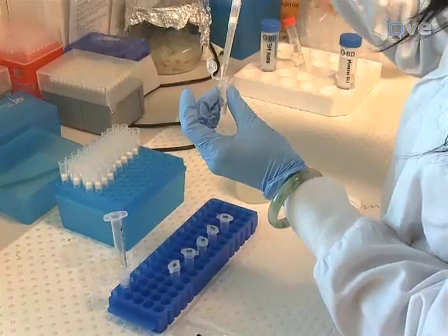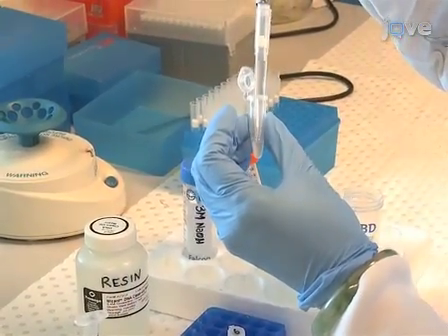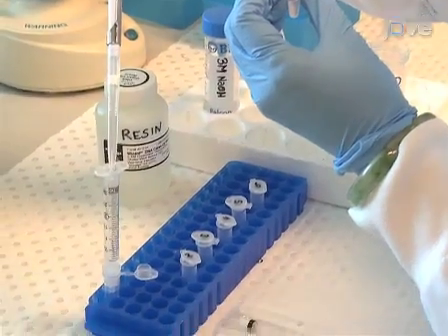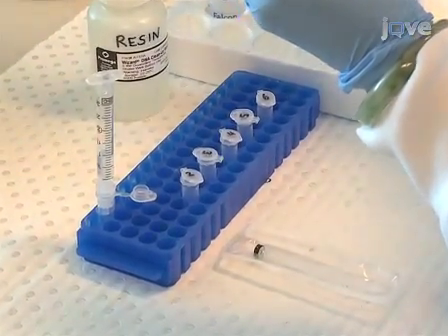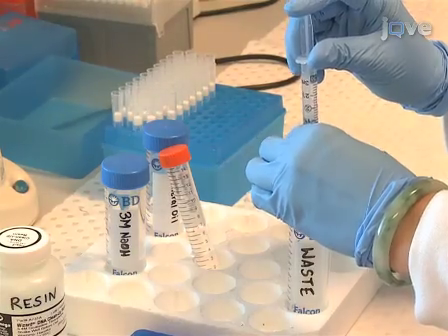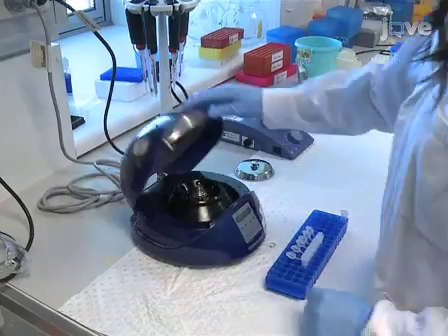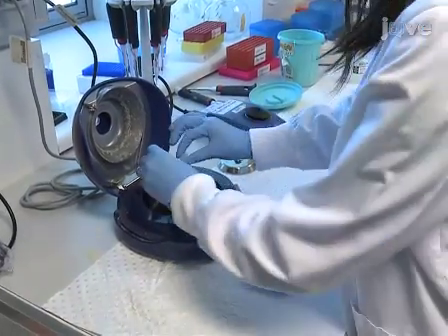Our lab uses the Promega Wizard DNA cleanup system. Add 1 milliliter resin to the DNA samples, invert the tube to mix, then pipette the solution into a syringe attached to a desalting column. To remove any free bisulphite ions, pass the bisulphite treated DNA through the desalting column and elute in 50 microliters of MilliQ water.